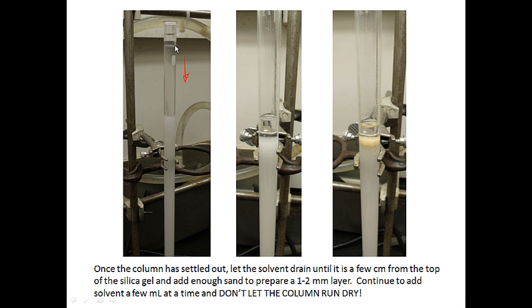And so we have to wait until the mobile phase gets close to the end, and then we're going to go ahead and add a little bit more of the sand to create a sand protective layer so that as I put solution into the column, I don't disturb the silica gel.